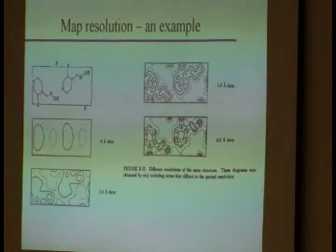And if it isn't too much effort, go back and try to make a crystal like that. But if that doesn't work, you can probably live with some not quite as good data. Christoph is grinning because he is trying to do that right now, right? How far does yours scatter?